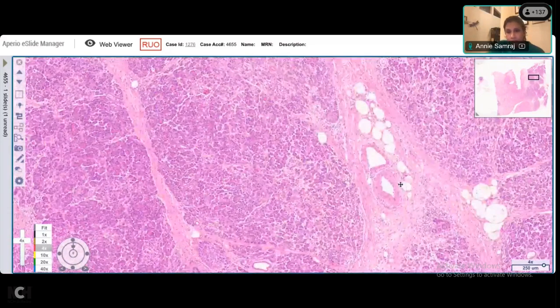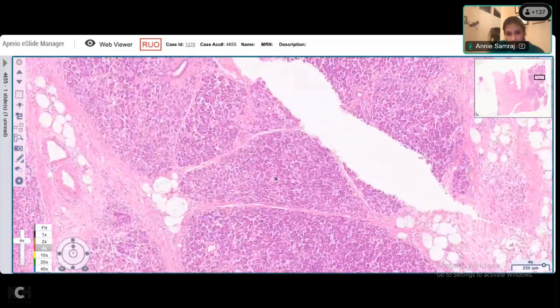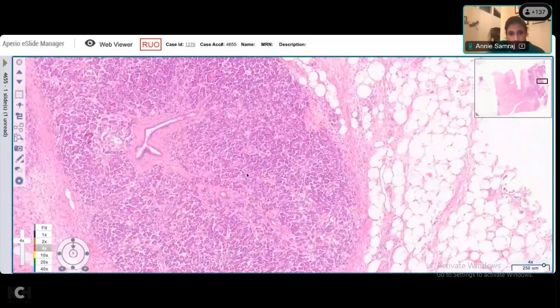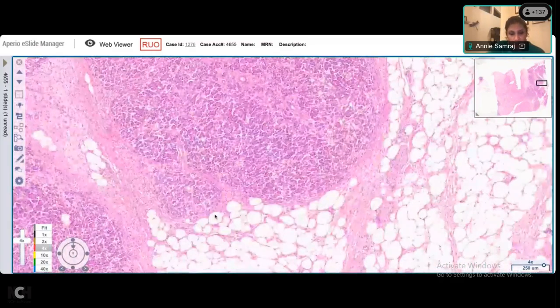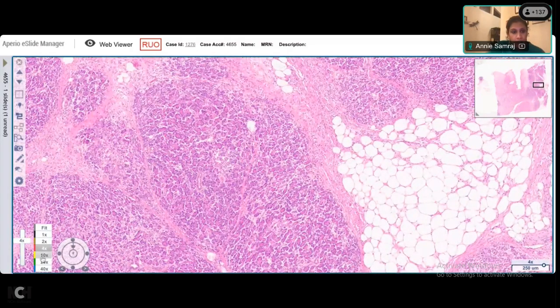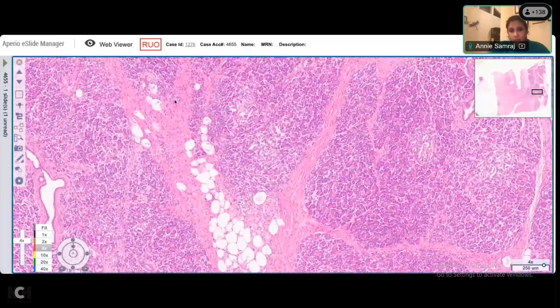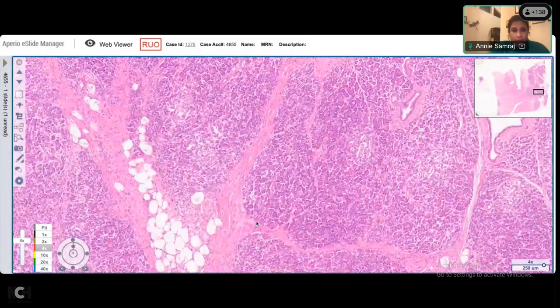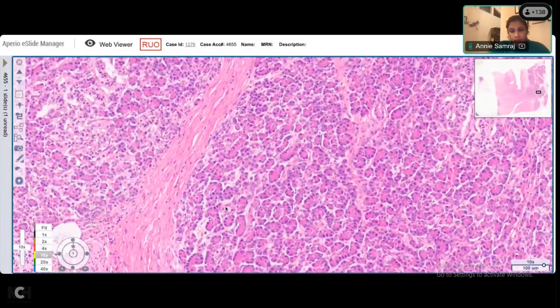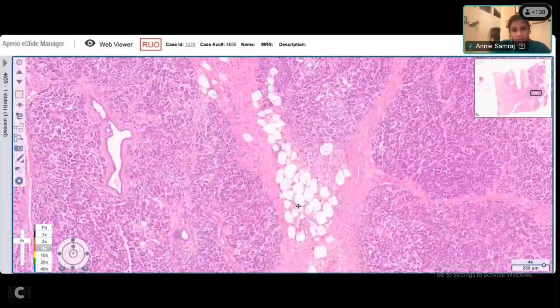And let's identify some islets. Islets stand out because they are pale, and you might see both compact and infiltrative types. So here is a more compact arrangement. We have fat, we have vessels, and here is a nerve bundle. So the neurovascular structures are present in the connective tissue septa.